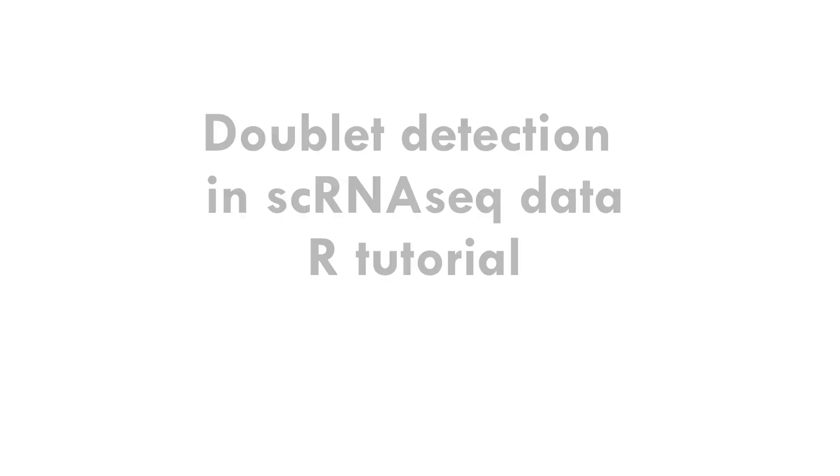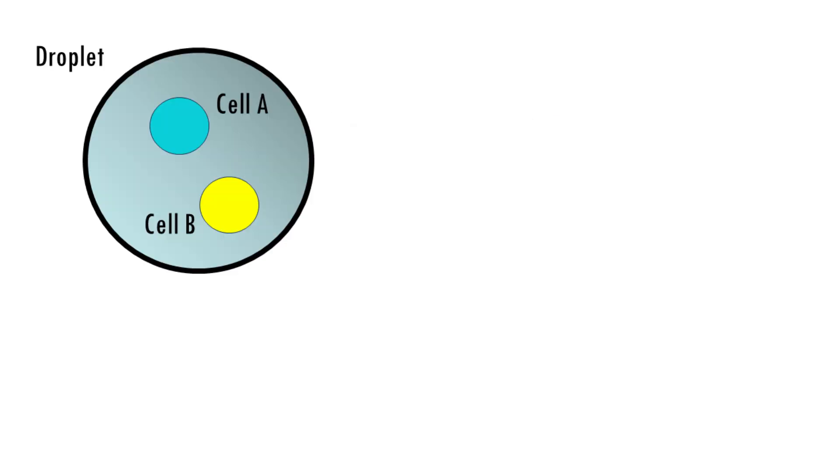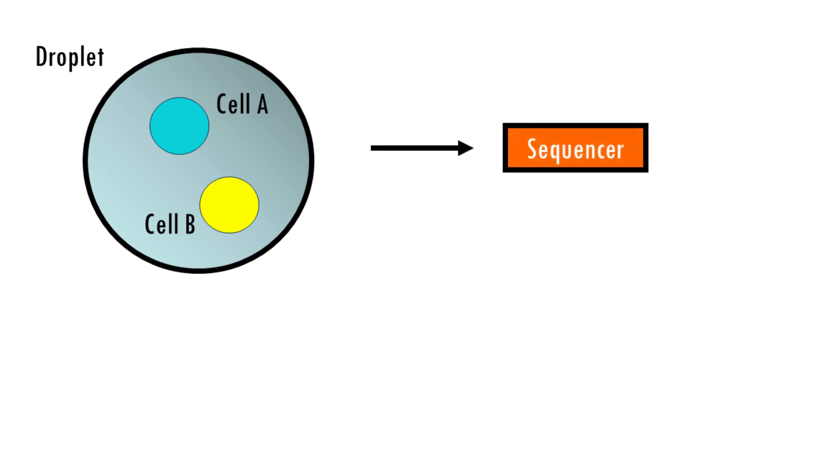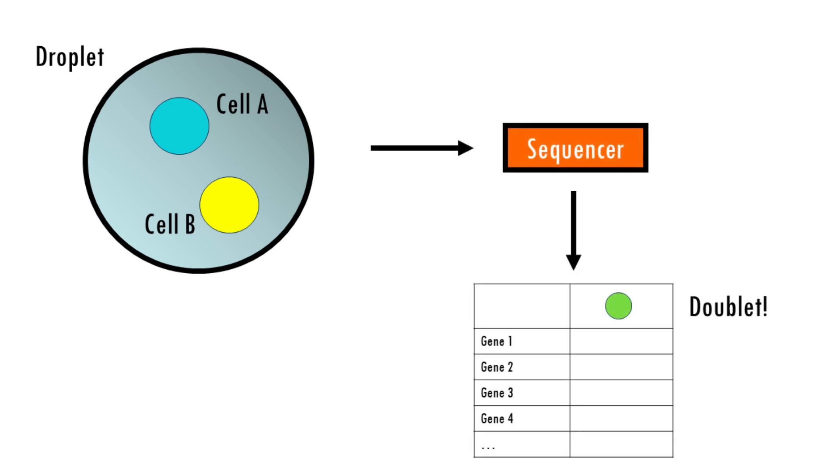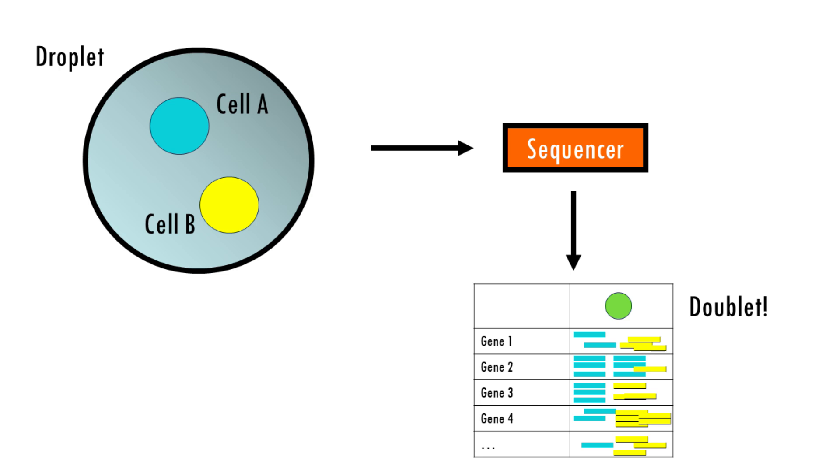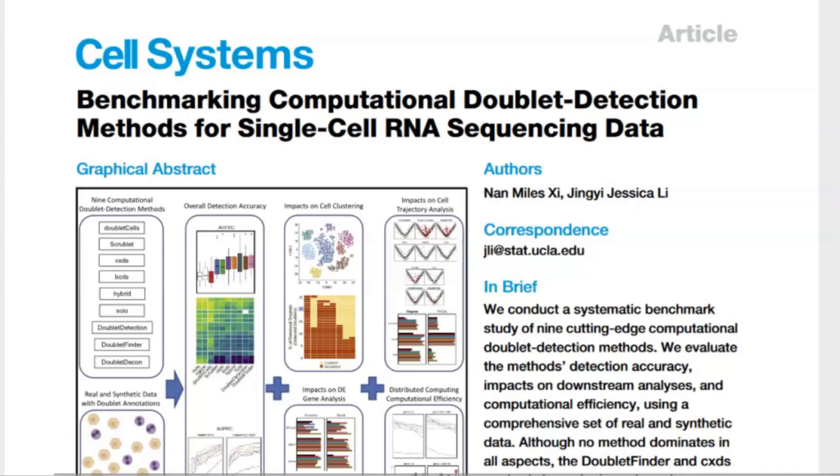Doublets are artifacts that occur when two cells are captured together and sequenced as one. This means that in your matrix for a given cell barcode you are getting gene expression data from two different cells. Obviously these doublets can really confound your downstream analysis, so it's important to identify them during the pre-processing steps and remove them.